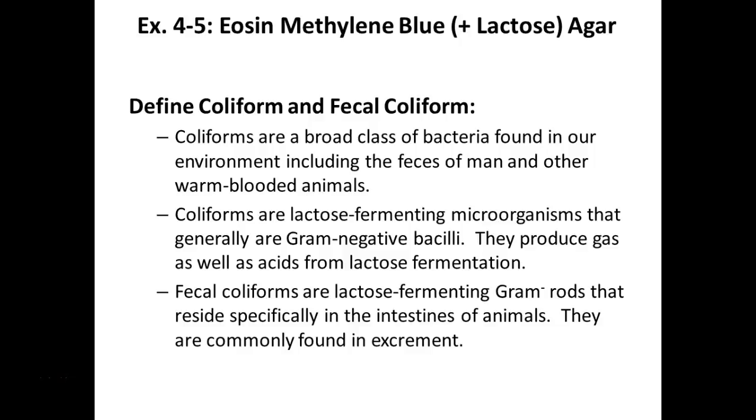The coliforms themselves, like E. coli, aren't necessarily bad, right? Most E. coli are non-pathogenic and we all have it. The problem is if E. coli is there, that means poop is there, y'all. That's where E. coli comes from. So that means other bad things like Salmonella and Shigella may also be there. Those guys are gram-negative, but they're not lactose fermenters. You wouldn't see them differentiate lactose fermentation on these plates.